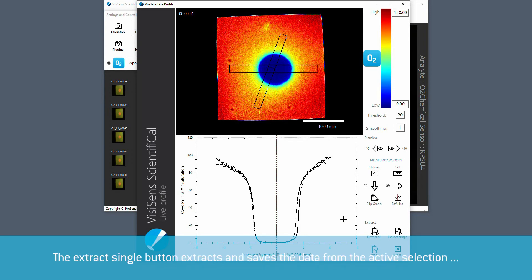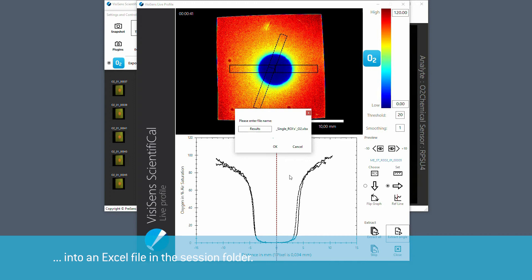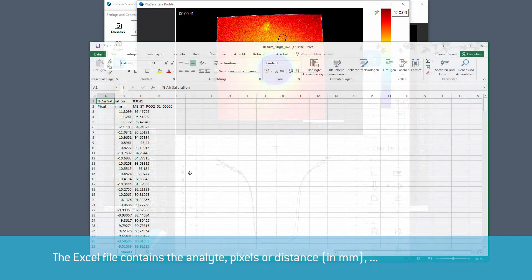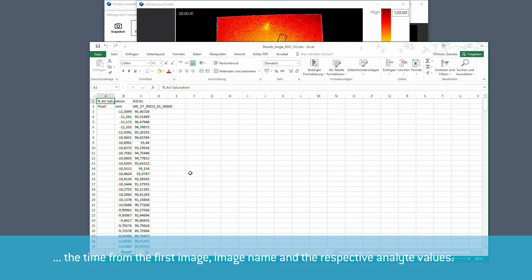The extract single button extracts and saves the data from the active selection into an excel file in the session folder. The excel file contains the analyte, pixels or distance, the time from the first image, image name and the respective analyte values.